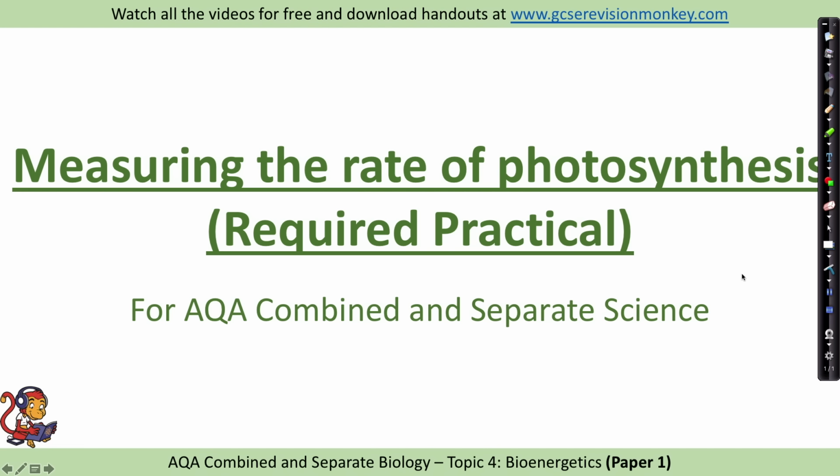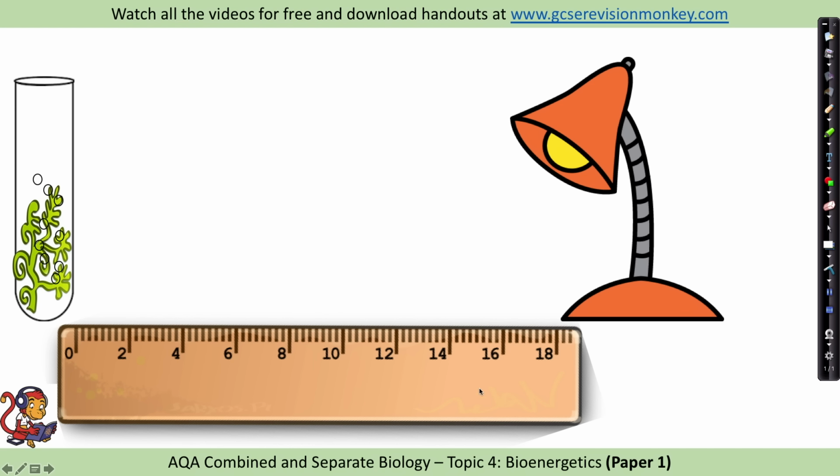Measuring the rate of photosynthesis required practical. In this practical, we submerge some pondweed in water, and the number of bubbles it gives off per minute gives us a rate of photosynthesis, and the investigation looks normally at how light intensity affects the rate of photosynthesis by moving a lamp closer or further away.